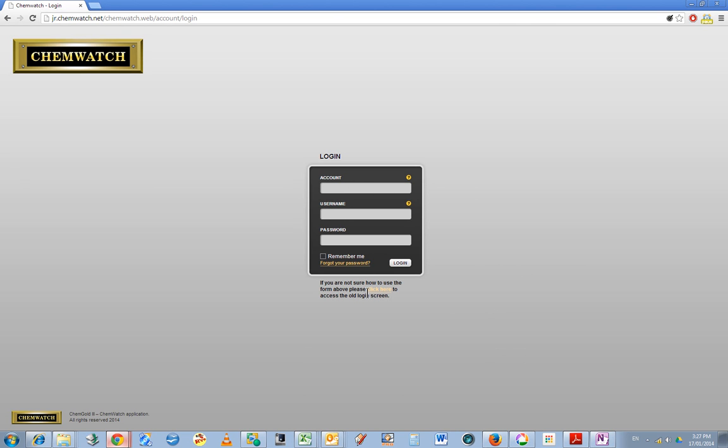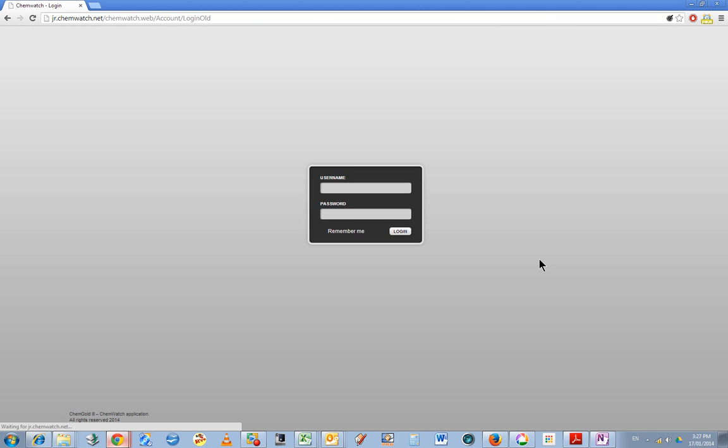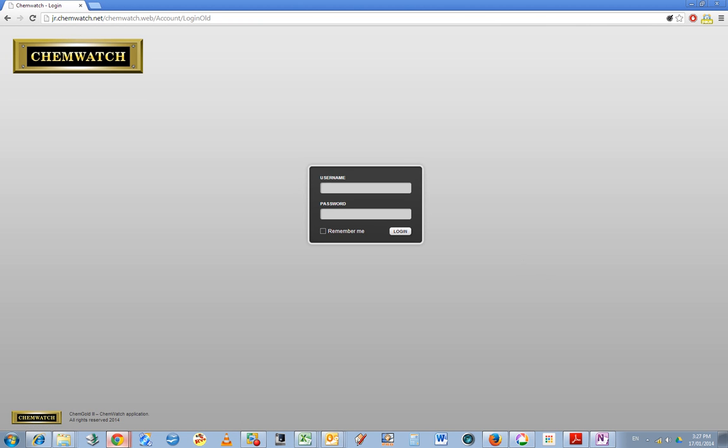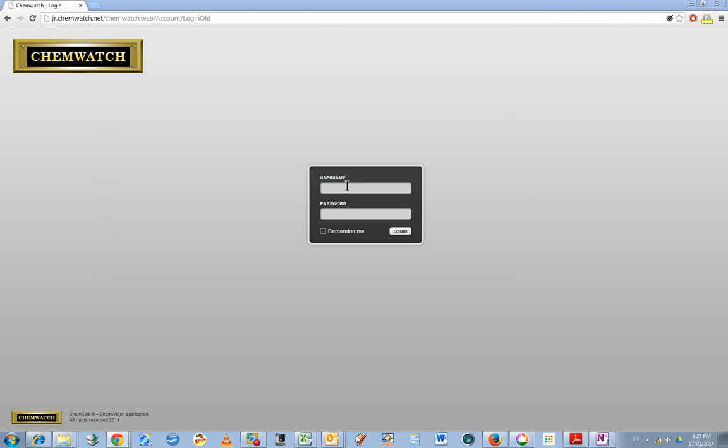If you click here if you're not sure how to use this form, you can go to the old login screen. Basically the information you put in that login screen is exactly the same as what you would put in the new login screen, which I will do now without showing on the video.